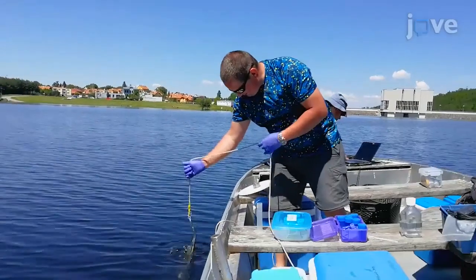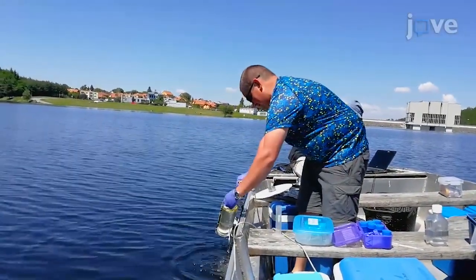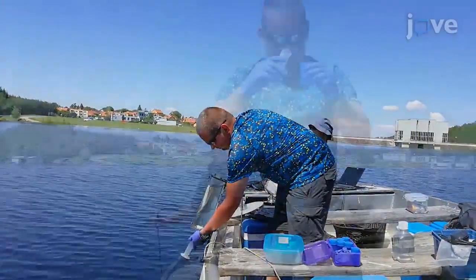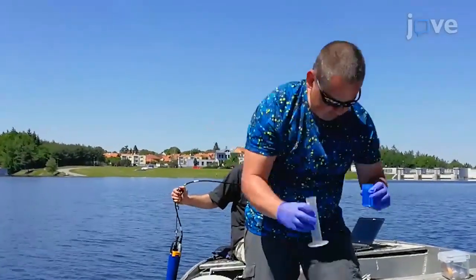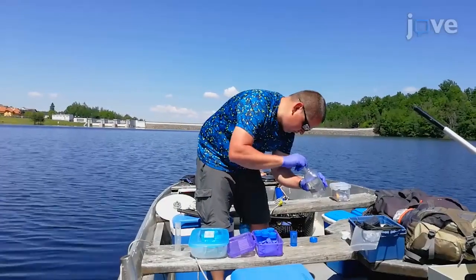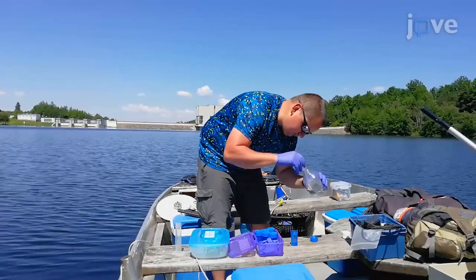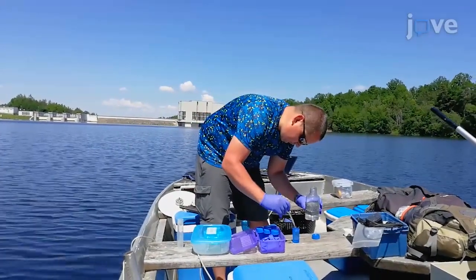To begin this procedure, collect water samples from the desired location at a suitable depth. Keep the samples in a temperature-controlled cooler, maintained at in situ temperature, during transport to the laboratory. Fix water and trap fluid subsamples for bacterial enumeration with formaldehyde for at least 1 hour to obtain a 2% final volume-to-volume concentration for each sample.